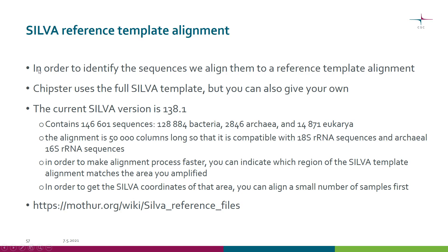The whole point of this process is to identify the sequences, and for that we align them to this reference template. In Chipster, we use the SILVA reference template, but you can also provide your own. The current full SILVA template, version 138.1, contains about 146,000 sequences.